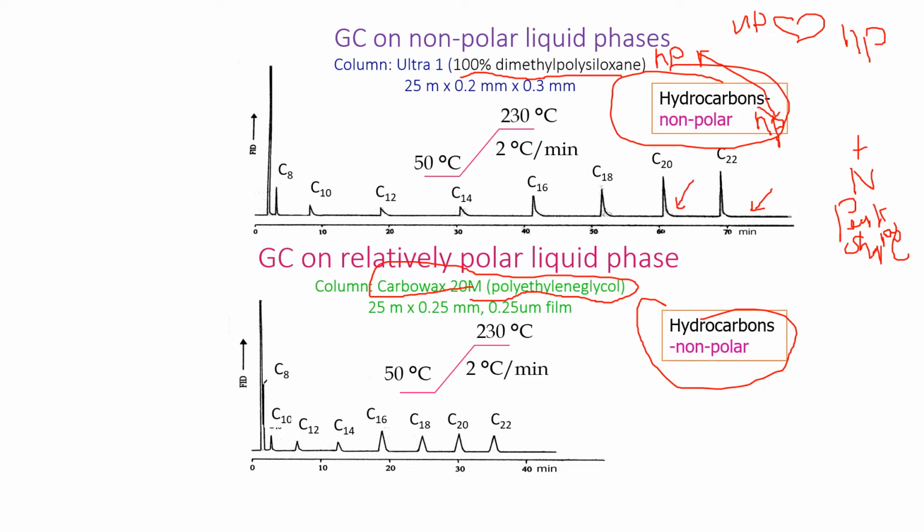And also the efficiency is okay. Why do you think this is? Because they love each other. This hydrocarbon sticks into the stationary phase longer because they love each other. So whenever the mobile phase comes in to dissolve them, the mobile phase needs extra work to dissolve them. So that's why we have something like this. We have a separation that is not that beautiful.